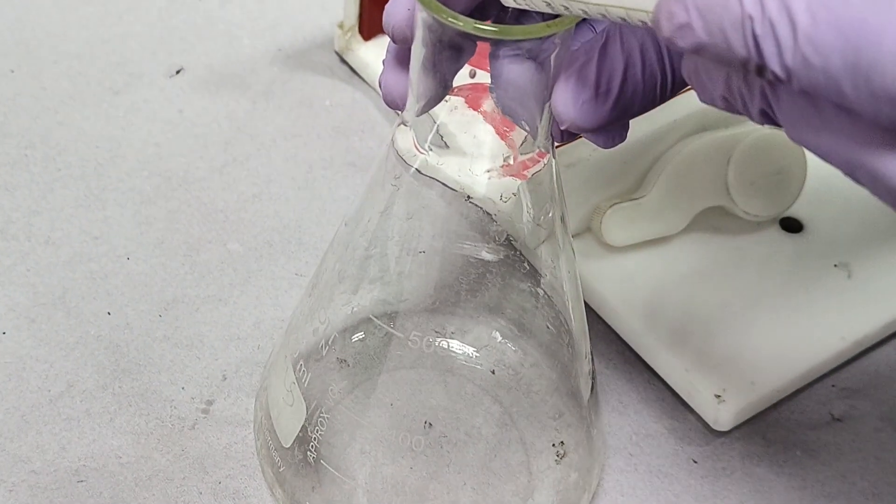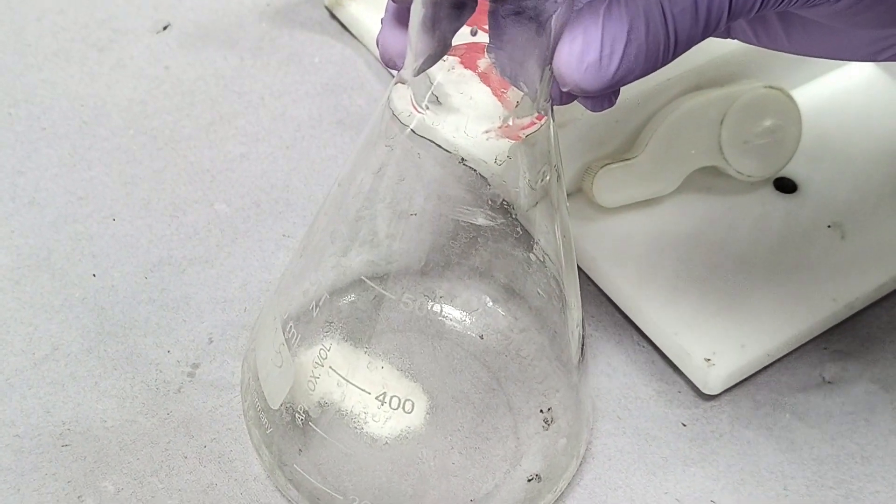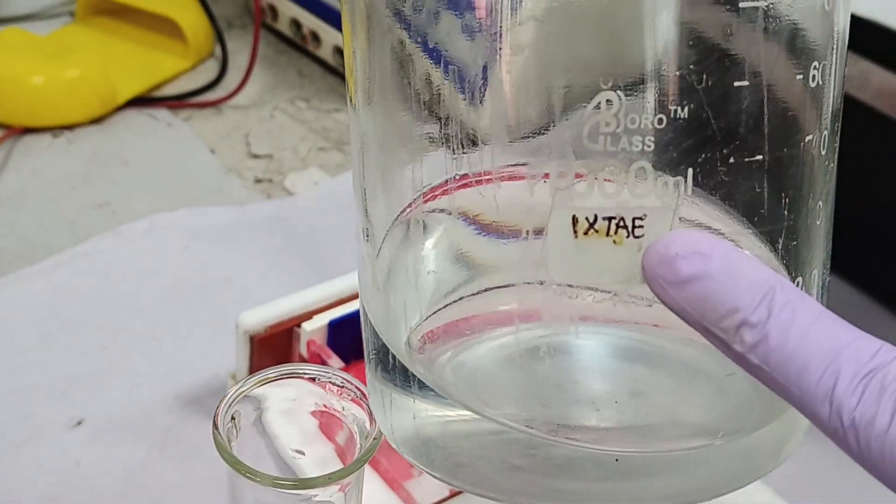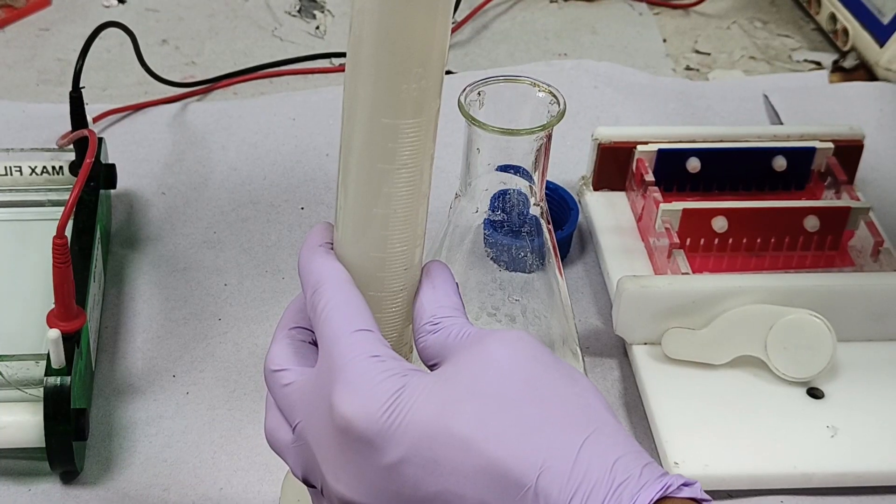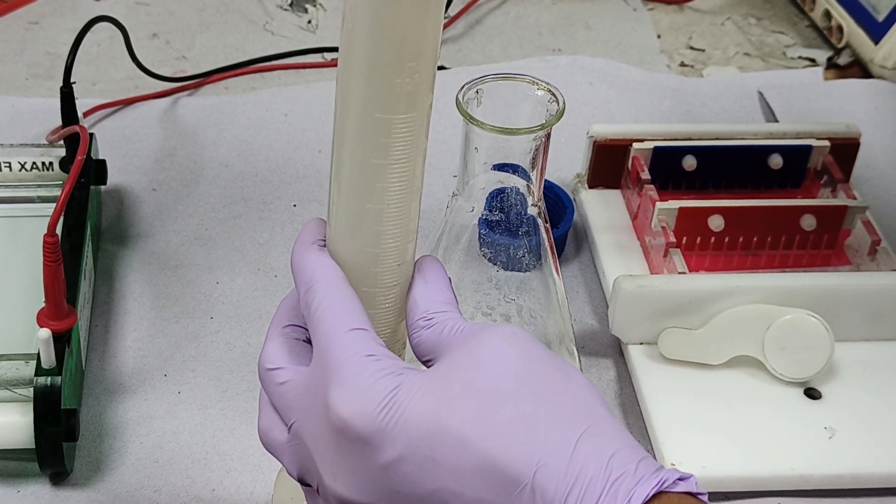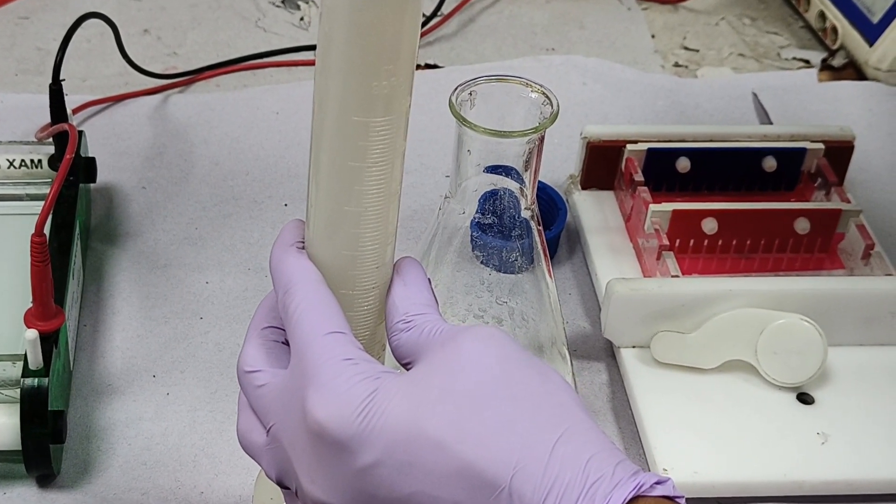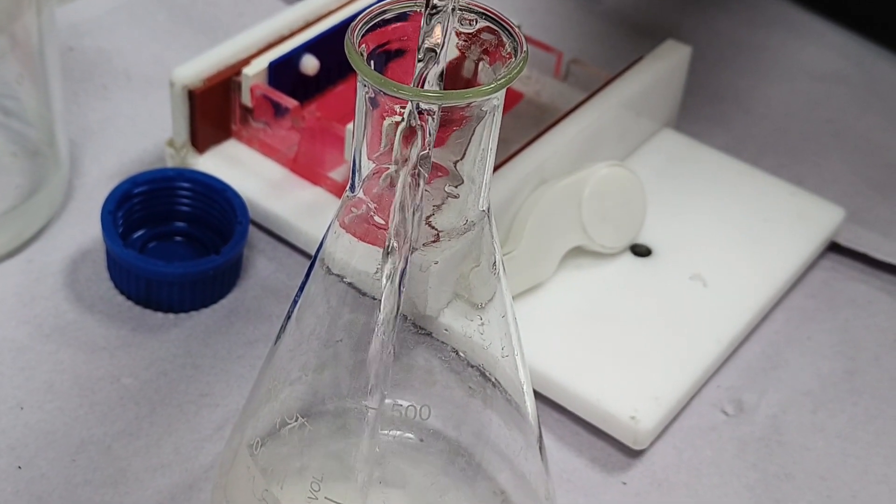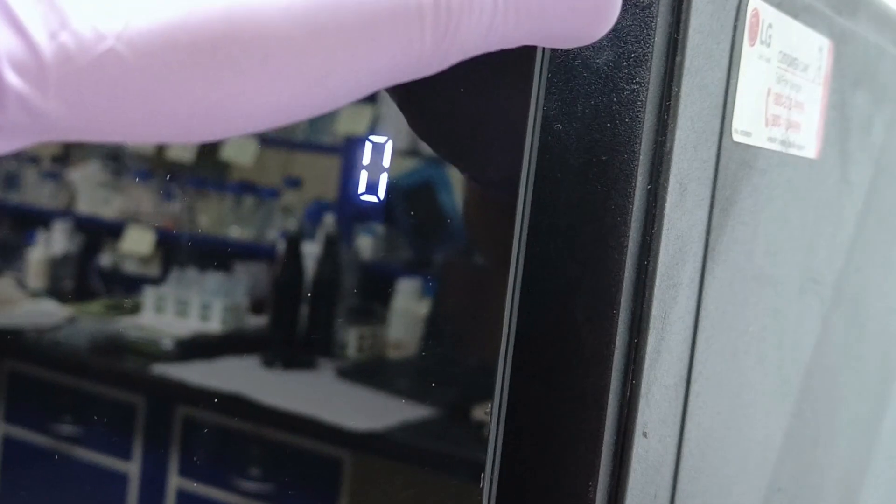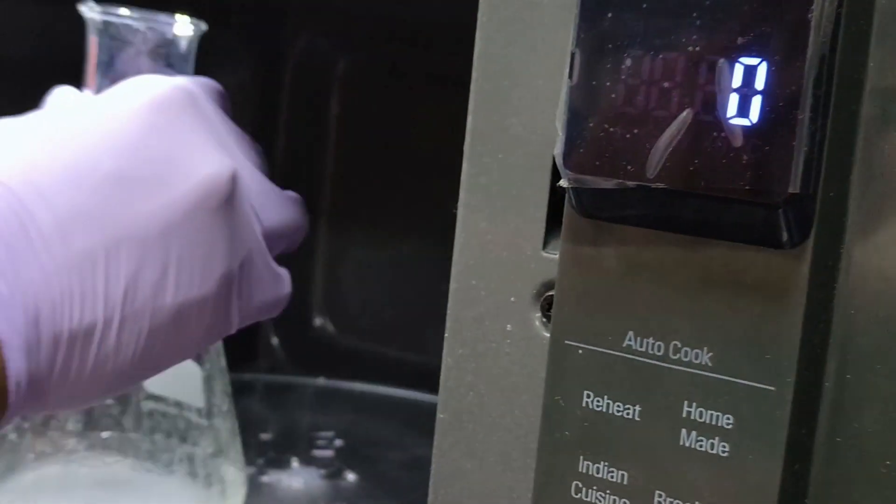Add the agarose to the conical flask. Measure about 100 ml of 1X TAE buffer, also known as the Tris acetate buffer, using a measuring cylinder, and then pour into the flask. Gently swirl the flask, and microwave it for about 2-3 minutes to bring the agarose to boil.